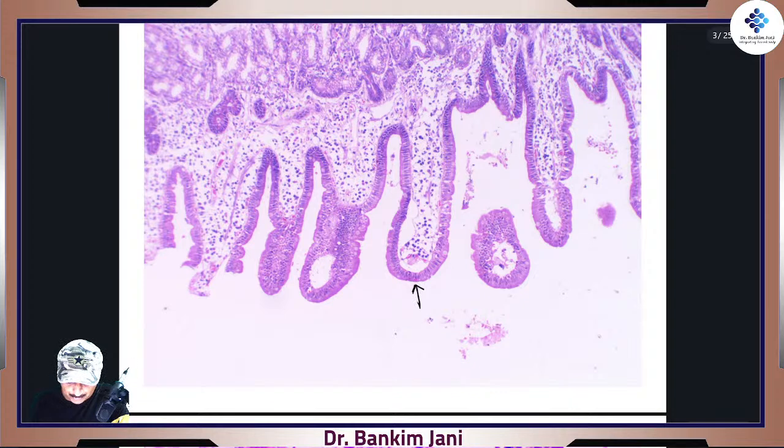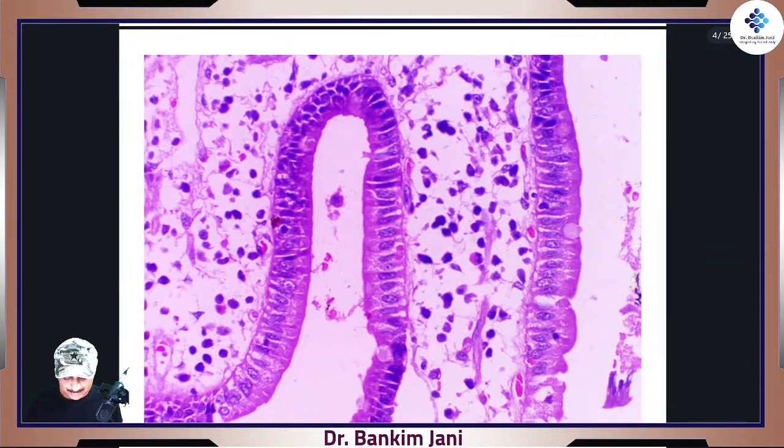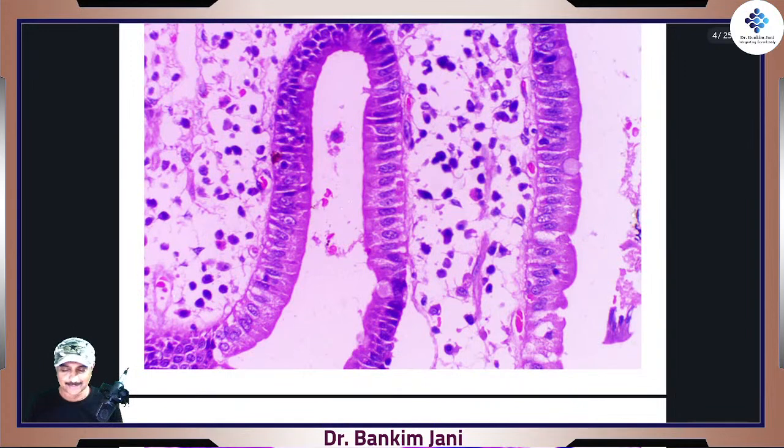Even if we have not zoomed, but when I first saw it on the microscope, the first time, actually my heart rate increased. Arey wow, itna badhiya, right? I was so tempted and the teacher was telling me, wait for 100x later on, right? First you watch it in this. I was so eager, yaar, to see this in high resolution. And this is how it looks like. See.